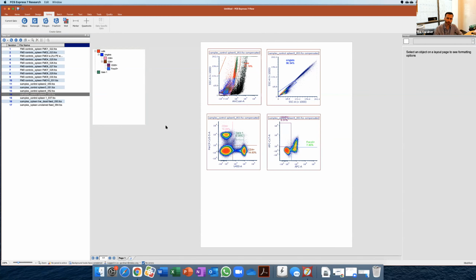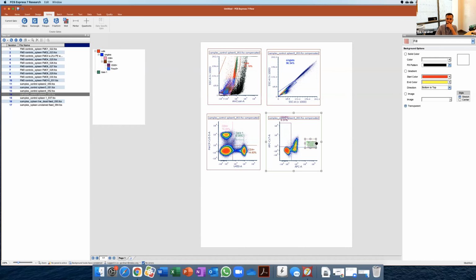And now probably one of the questions you're asking is, okay, so this is the single positive population for FOXP3, but it's negative for CD25. Now, it's very important to understand that whenever we set the threshold between negative and positive, especially if they don't resolve... if they resolve very well, then it's obvious.